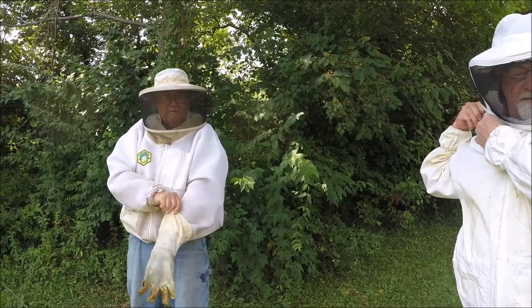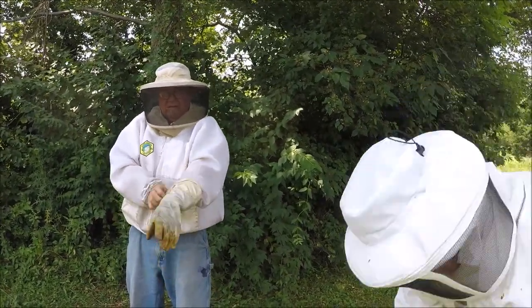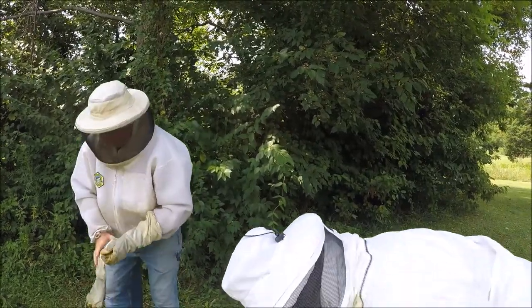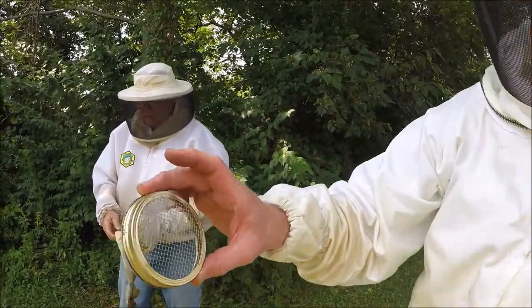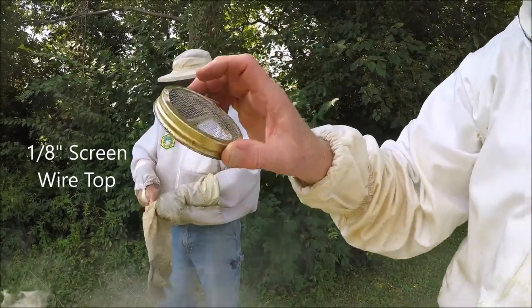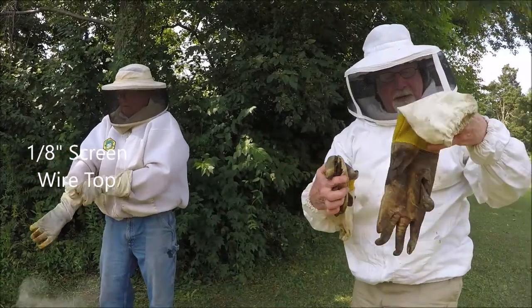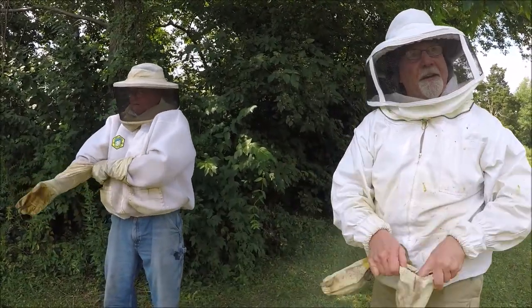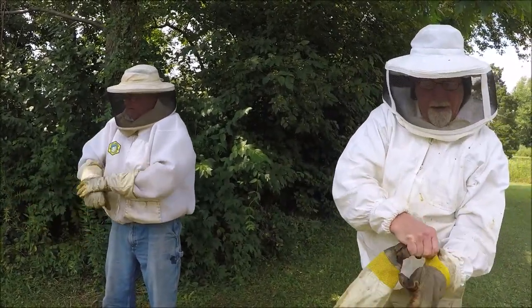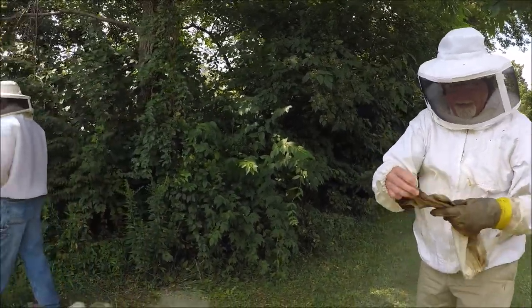About a quarter of a cup of powdered sugar in a quart jar. It's got a screen wire top on it — eighth inch screen wire top — so the bees can't get out. They don't like being in there, but it's their duty. It's either that or an alcohol wash, which they really don't like. That's a good point.